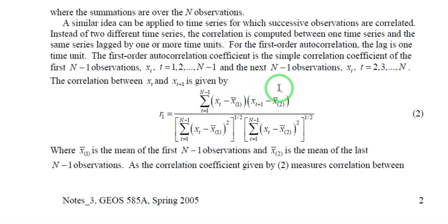So you will see that for the time that this delay is 0, we have only xt and xt which are multiplied together, and we will get the xt to the power of 2.